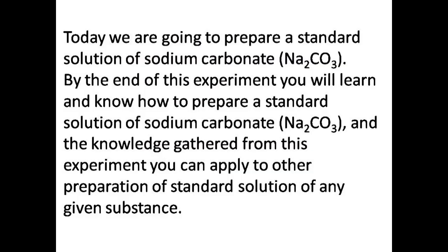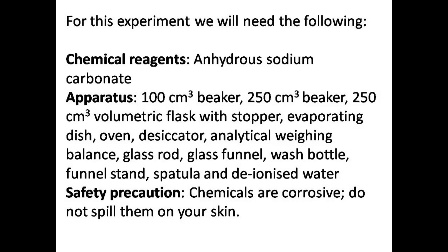Today, we are going to prepare a standard solution of sodium carbonate. By the end of this experiment, you'll be able to know how to prepare a standard solution of sodium carbonate, and the knowledge gathered from this experiment you can apply to other preparation of standard solutions of any given substance. For this experiment, we'll be needing the following chemical reagents and apparatus.